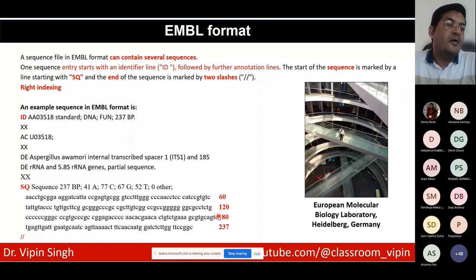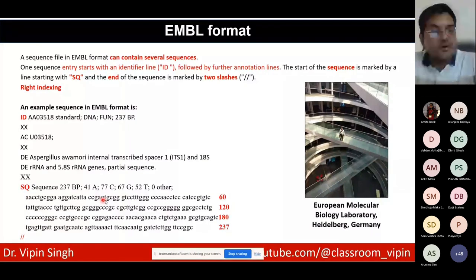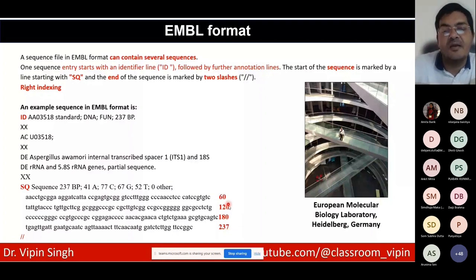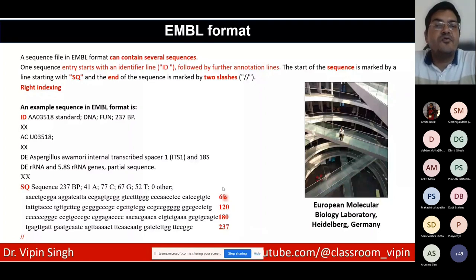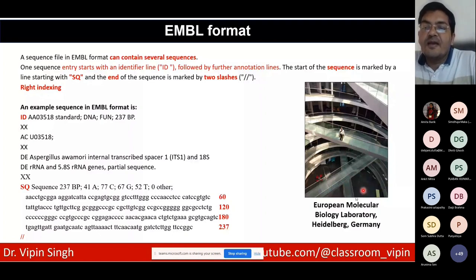The EMBL format has its own fields. The sequence begins with the 'SQ' line followed by a one-line annotation, then the sequence again in blocks of 10 nucleotides, with 60 nucleotides per line and indexing on the right side — 60, 120, 180, and so on. The EMBL format originates from the European Molecular Biology Laboratory in Heidelberg, Germany, one of the major centers of bioinformatics in the world.